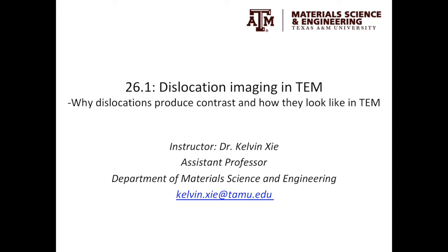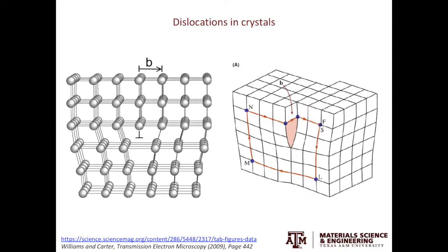Howdy, in this video we'll start talking about dislocation imaging in TEM. We will focus on why dislocations can produce contrast and how dislocations look in TEM. Just one slide on dislocations.